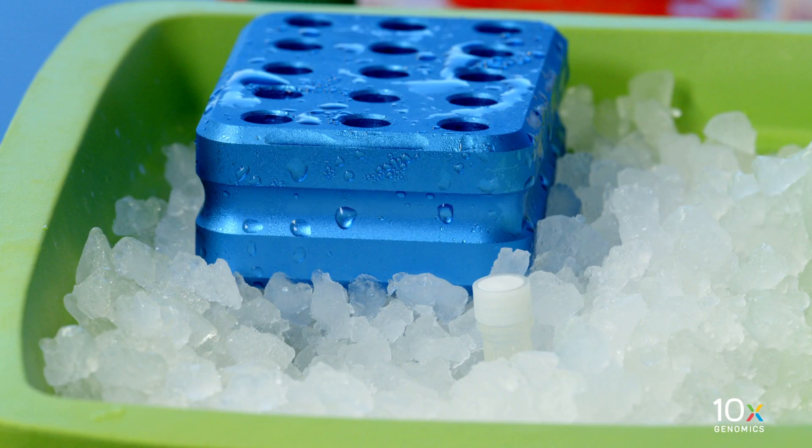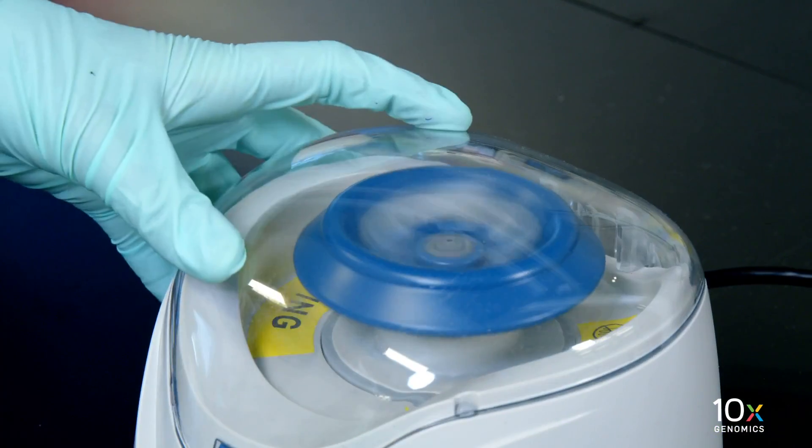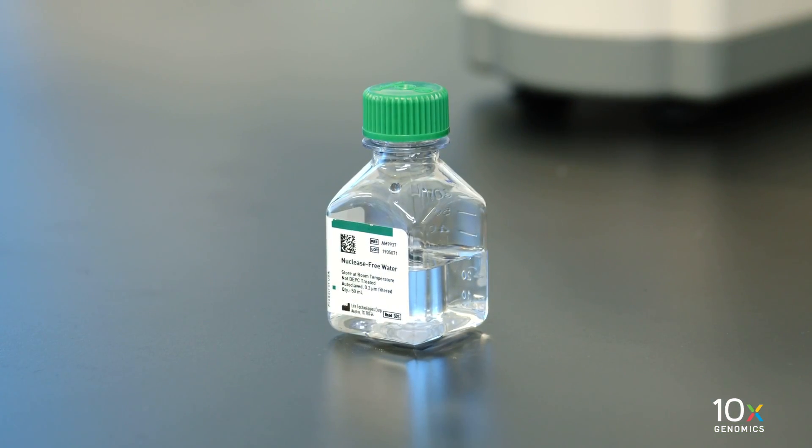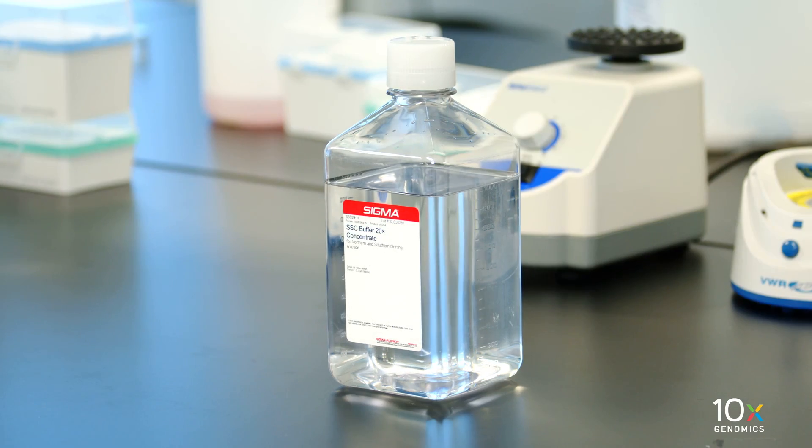We have probe ligation enzyme. Centrifuge briefly and maintain on ice. Finally, we have nuclease-free water and 20X SSC buffer.